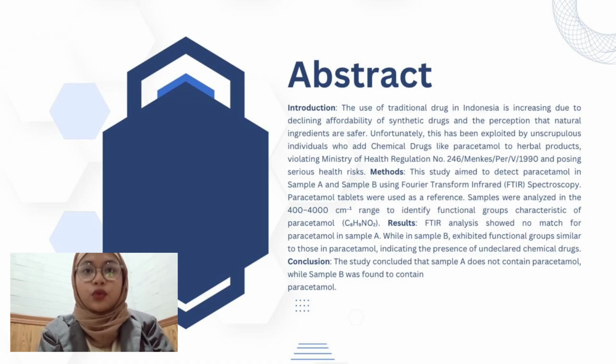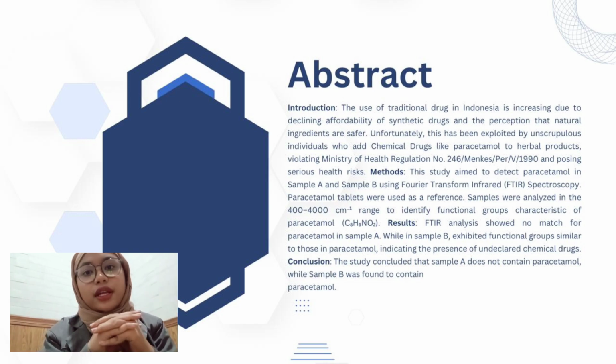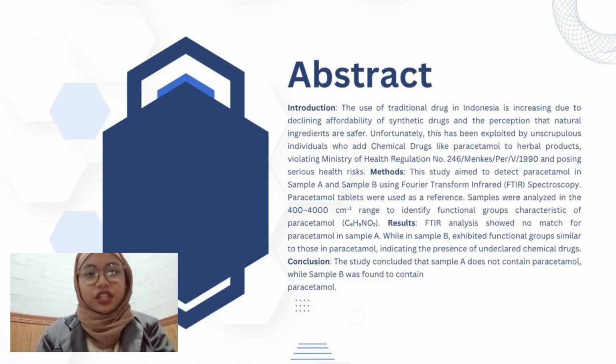In our study, we use Fourier transform infrared, or FTIR, spectroscopy to detect paracetamol. We test two samples, sample A and sample B, and compare them to a reference paracetamol tablet to identify their characteristic functional groups in the 400 to 4000 inverse centimeter region.